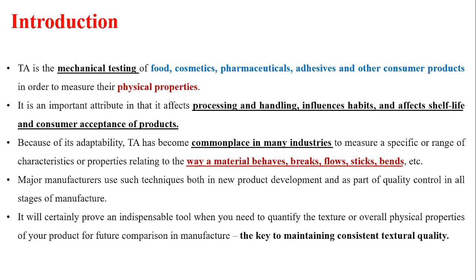Texture analysis has become commonplace in many industries to measure a specific characteristic or range of characteristics or properties of the products, such as the way material behaves, breaks, flows, sticks, or bends, etc.